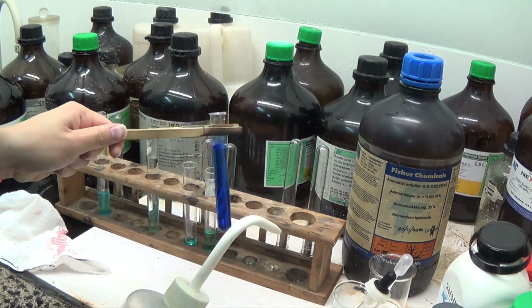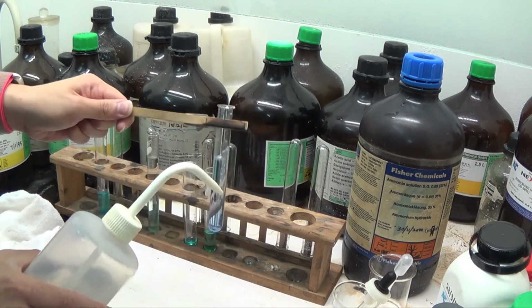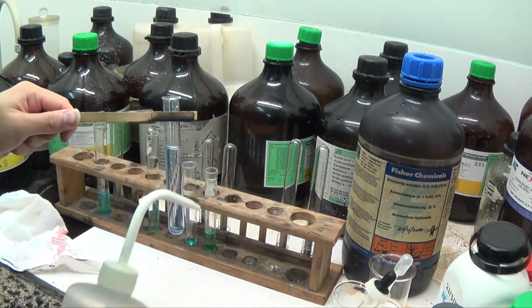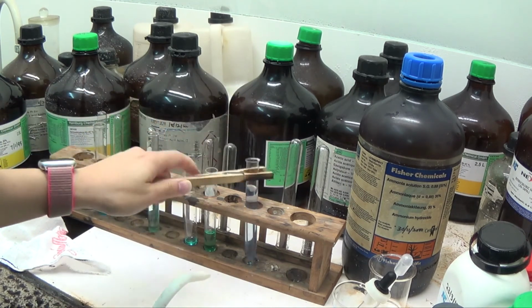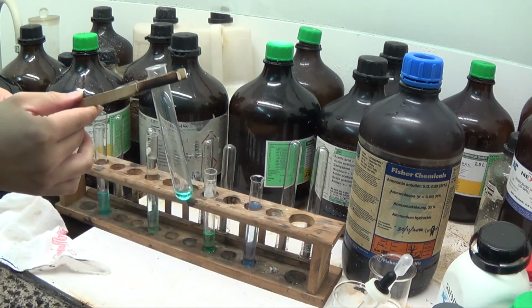And in a very large amount of water, if I remove some of that solution and then keep on adding water, this solution will eventually, because I'm introducing more and more H2O to it, the deep blue solution will go back to the pale blue solution because it drives back the equilibrium where the water molecule replaces the NH3 molecule, and I should get the pale blue solution. So it's still pretty concentrated with the ammonia complex. So it should pretty much go back to this color later on.